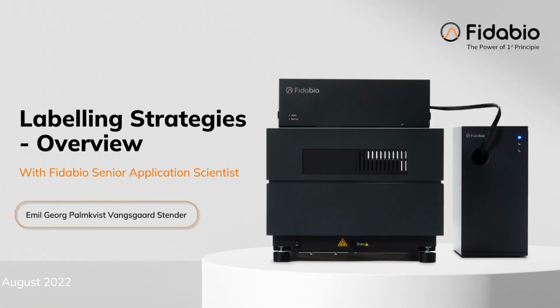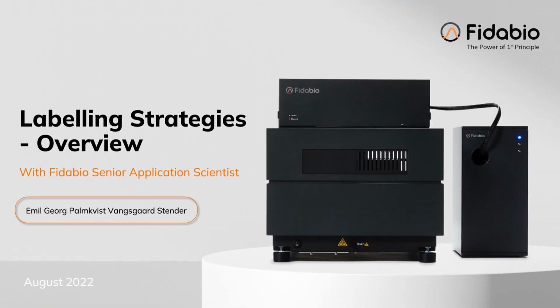Hello everyone, and welcome to this overview of labeling strategies for your FIDA experiments. In this video, we'll be going through the parameters for selecting labels, as well as some of the multiple different labeling strategies available to fit your experimental setup.